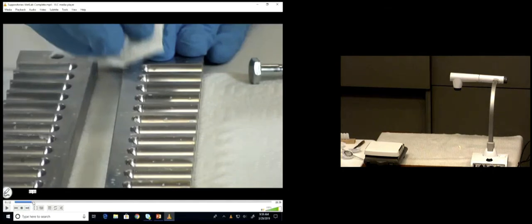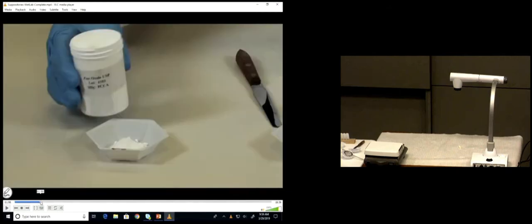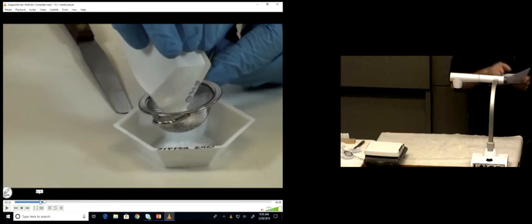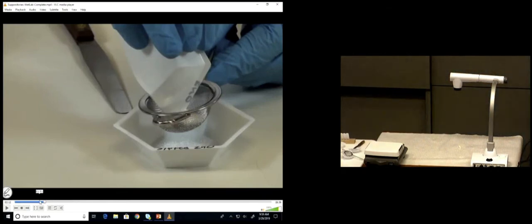There isn't any junk in there. Then put them back together. All right. Then you're going to weigh your zinc oxide. So on your procedure real quick, look at your handout where it says step 2, pre-sift some zinc oxide. Cross off pre-sift. It's pretty fine and you'll waste your time. So you don't need to pre-sift nothing. Just weigh 1 gram of zinc oxide. That'll just make life a little bit easier.